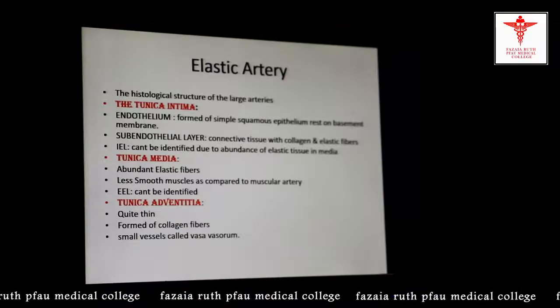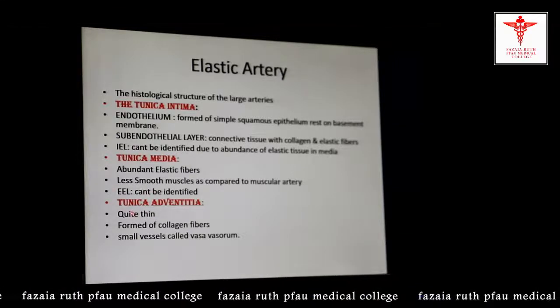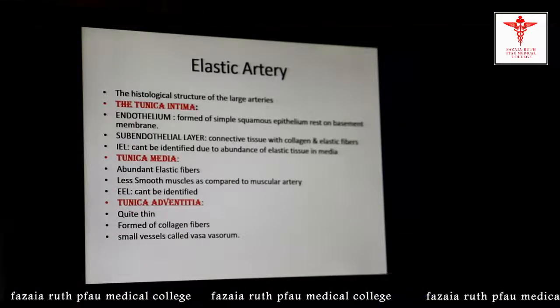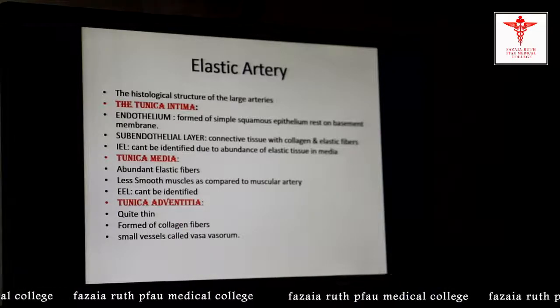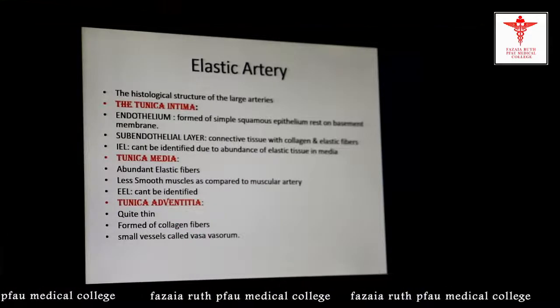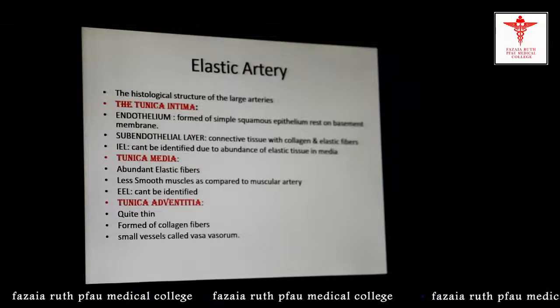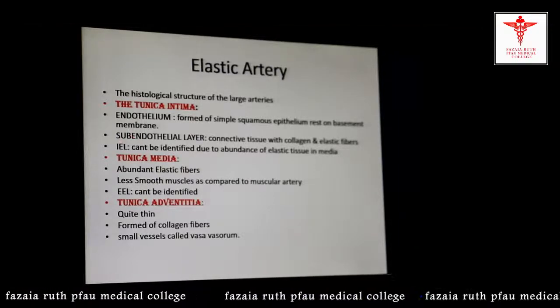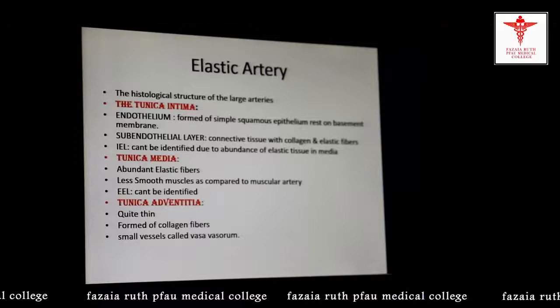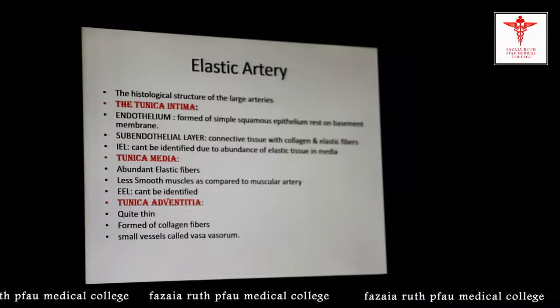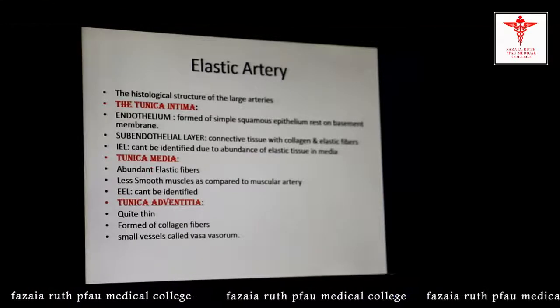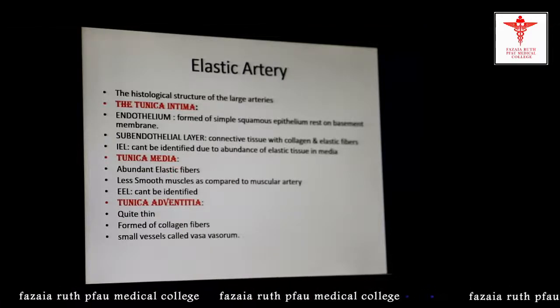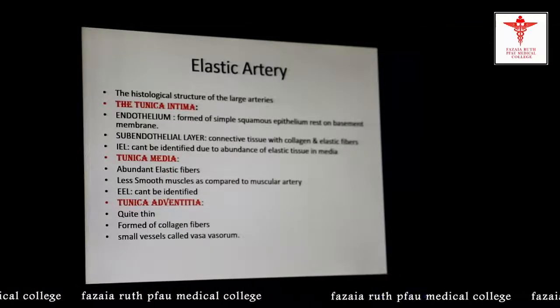The tunica adventitia is quite thin and composed of collagen fibers, and has the vasa vasorum. In summary, in the elastic arteries the internal and external elastic lamina are difficult to identify, the tunica media is richly filled with elastic fibers, and the adventitia is quite thin.